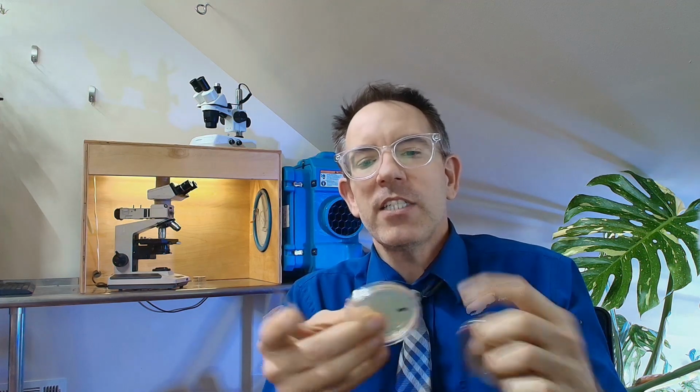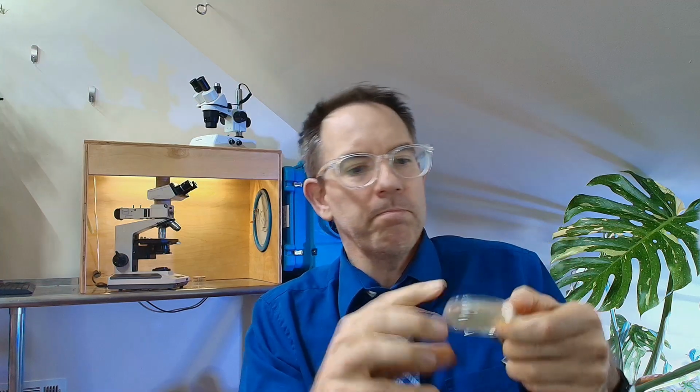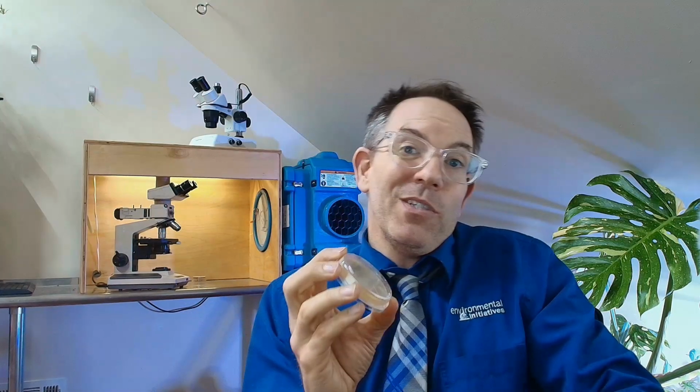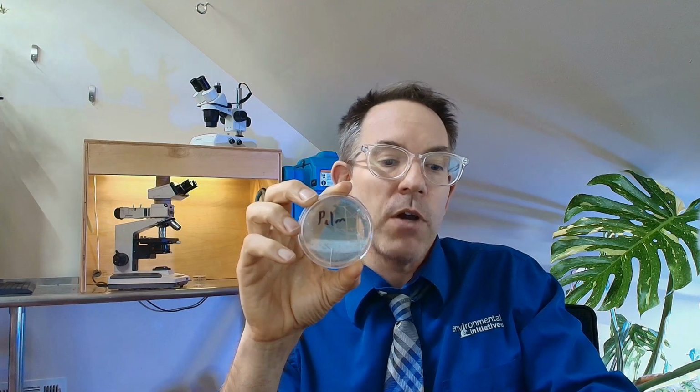You're going to then take tape. I don't care what you take, any sort of tape. You tape it on both sides like I'm doing here, just a little piece of tape on each side so it doesn't flop open. All right, now it's locked down. Then you simply write on it with a pen. Let's call this one palm sample. You write your location on it so you know where it's from.